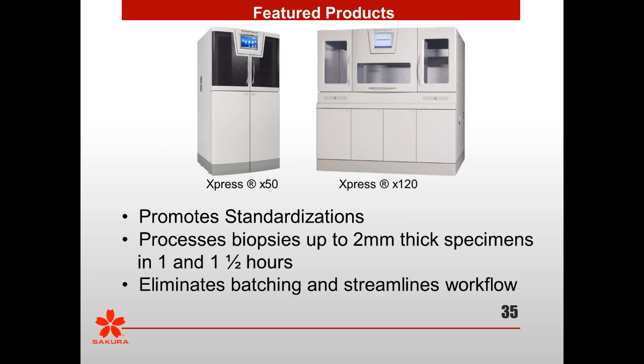Straight isopropyl alcohols can be a little harsh, so typically, if it's a small biopsy and it's completed its fixation time, we use a molecular fixative, which is a little less harsh on the tissue. We tend to get better performance with it. You can use graded alcohols, but if it's past your fixation time, your stabilizing or holding solution should stop the formalin. You want to start removing it, so it would be an alcoholic type of solution.